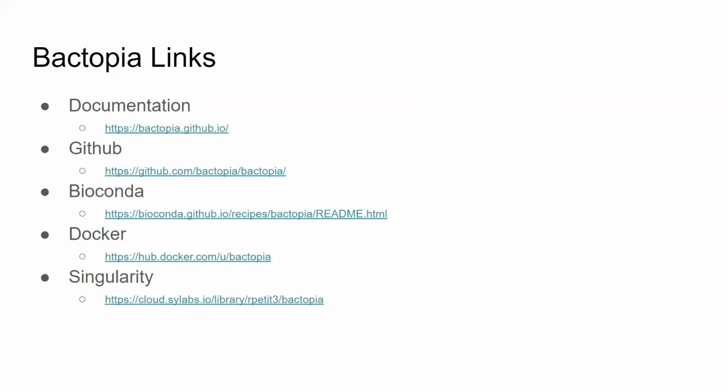Yeah, that's the fun thing I think about Bactopia, this ability to give your own data sets. You're not stuck with what's coded into it. Sure. And that also kind of puts the responsibility of your own data sets on you and not me. So it's kind of nice to have that door for you to be able to walk through and do what you need to do, versus saying, "Hey, Robert, will you open this door for me?" and that type of deal. So yeah, there's nothing stopping you from doing that.